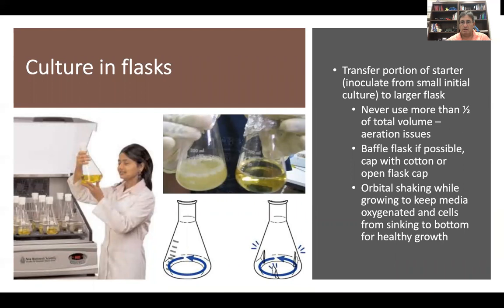So we culture in flasks. An important part to think about is that you're culturing in these shaking incubators, using standard flasks or flasks with baffles. The flasks with baffles allow for better mixing of your bacteria, so you don't get different layers of oxygen saturation. As your cells start growing, they're going to be using a lot of oxygen to do their metabolism. By mixing these, when they're open, you can ensure that the oxygen from the surface layer is getting diffused and mixed throughout the cell flask. You get a little bit better growth when you have baffles, or little bumps, around the sides of these things.